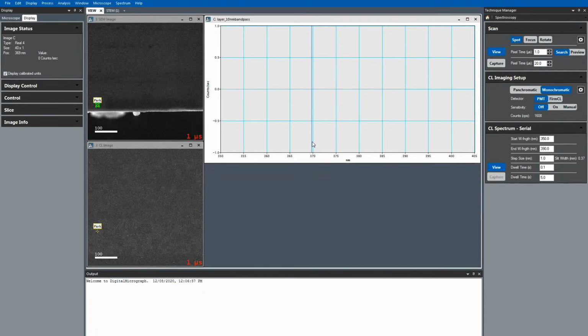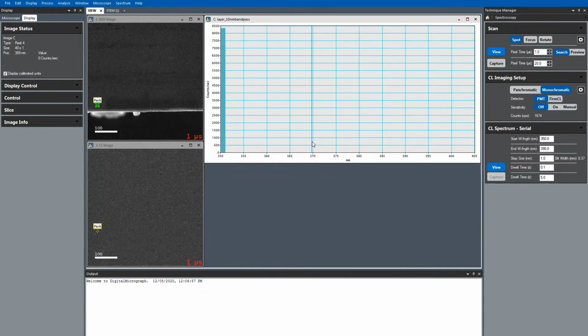Oh, so that's actually a good point, Alan. So Alan mentioned 730 is double 365. Could be a detector artifact. Could be double counting, just like you get double counted EDS peaks maybe.